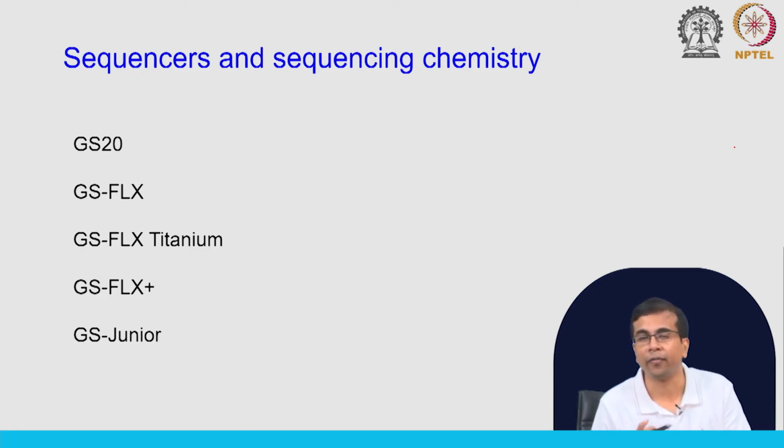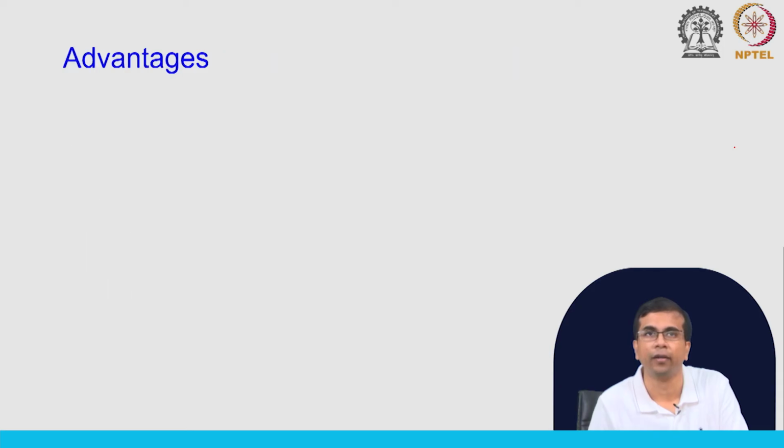that were available when 454 sequencing was done. So, these are again slightly different chemistries, slightly different processes, and slightly improved ones. Also the differences in throughput, how many sequences you can get in one experiment. Sometimes you have fewer samples, in some cases you have a very high number of samples. So, depending on your need you would use these platforms. These are the names of them and you could use them if you wanted to do 454 sequencing.